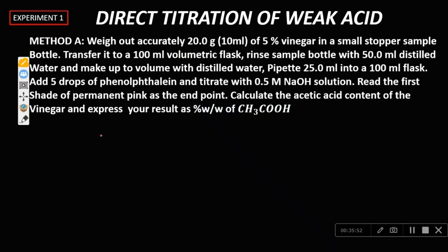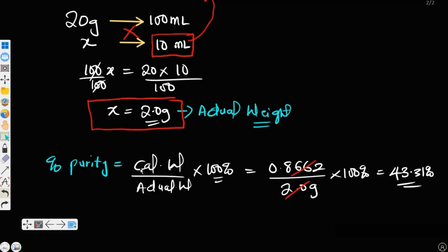And I think that is the only question that is here. Express your result as percentage weight by weight. So your result now will be 43.31% weight by weight. Are you getting it now? So that is basically that for this one.